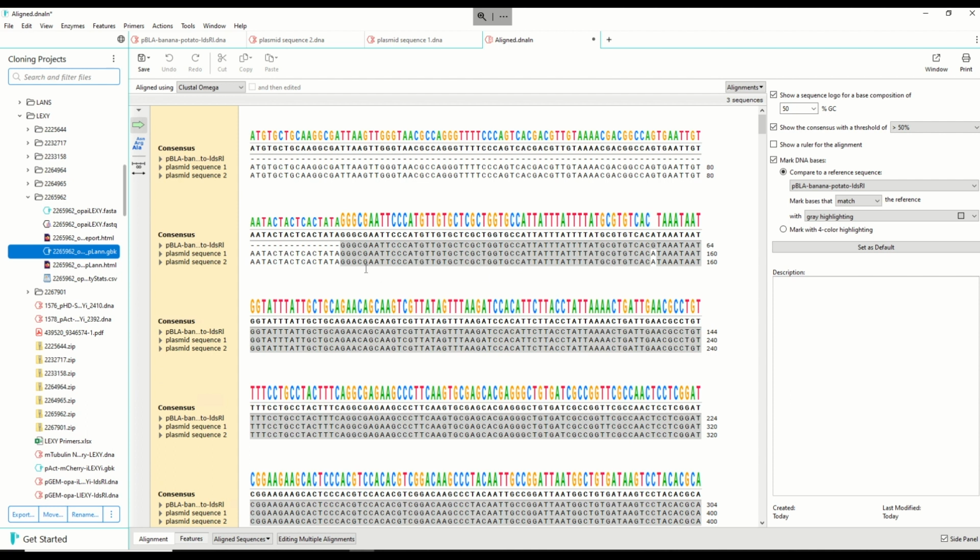You see how this is basically a perfect match, right? Except all of this, right? That is because 0 location of the sequencing result is not the same as the 0 location in the plasmid of your template, right?